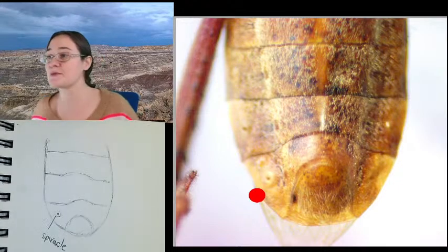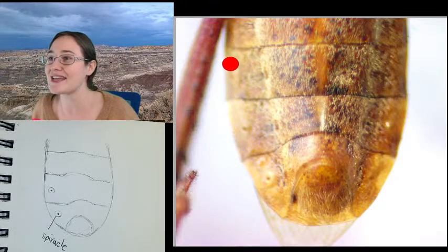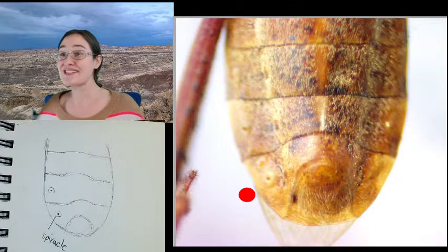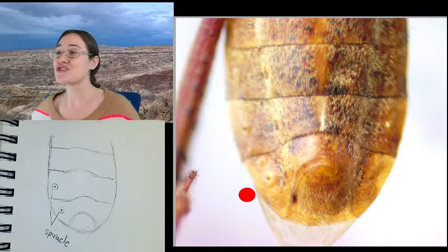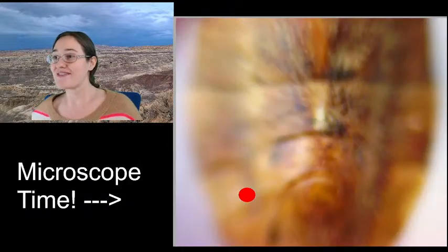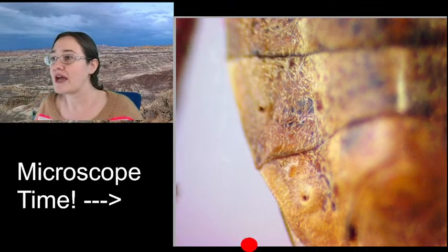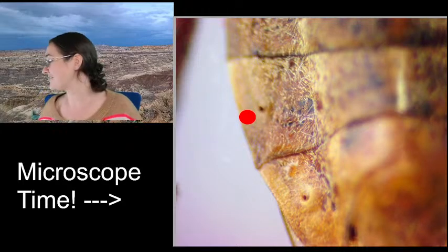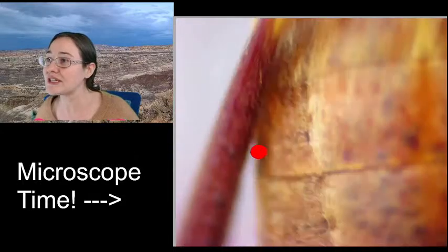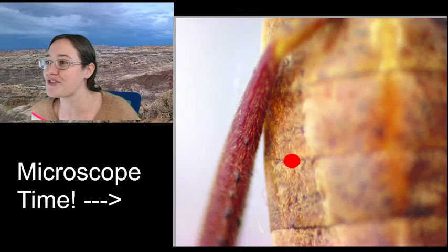And that is only one spiracle, but we do have spiracles, it looks like, on almost every abdominal segment. So I'm going to go back and check and see how many of these segments have spiracles. But this is how insects breathe, right? They don't breathe through their mouths, because their mouths are busy eating, right? She is so busy slurping up plant juices that she doesn't have the ability to also use her mouth as a breathing tool. So what insects do is they breathe through diffusion. That little hole right there is how my insect gets oxygen. That little itty bitty hole right there, right? And each one of these little holes, let's see, I want to see how many we can find. There and there. Oh, they're going to be pretty much on the lateral after that, so we weren't going to be able to see them.